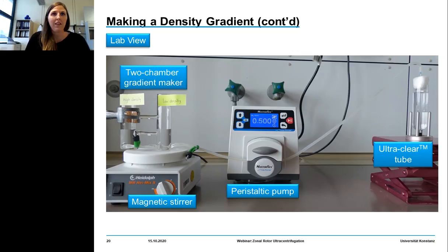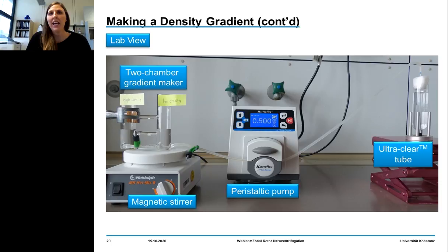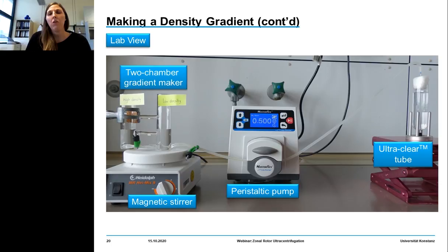Such a scheme often looks more complex than it is. Here is our setup: on the left side is the gradient maker and magnetic stirrer, in the middle the peristaltic pump, and on the right side the centrifuge tube. For rate-zonal separation, a thin-walled ultraclear tube is recommended — ultraclear because you want to see your bands, and thin-walled because you want options when isolating particular bands.